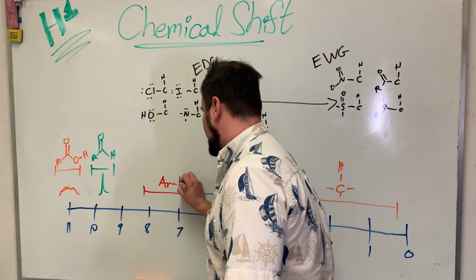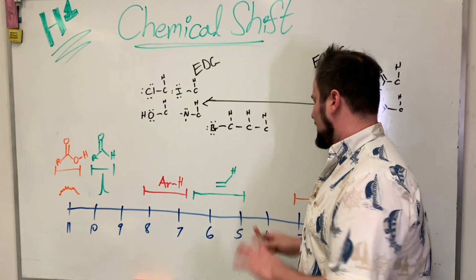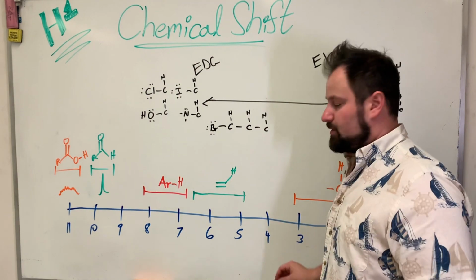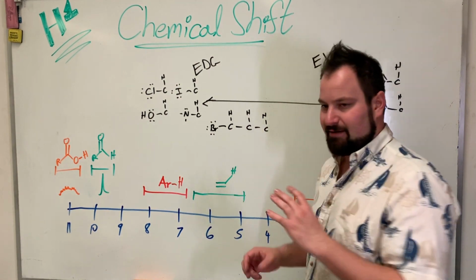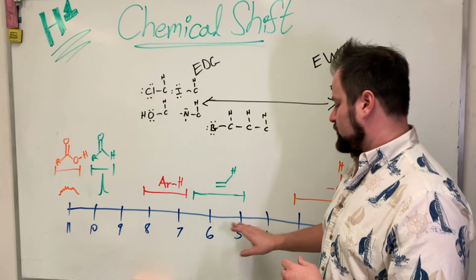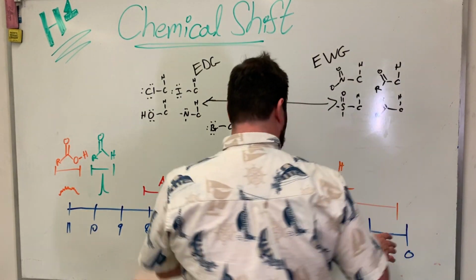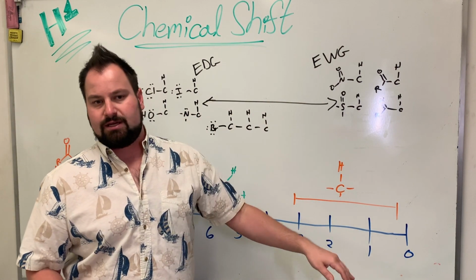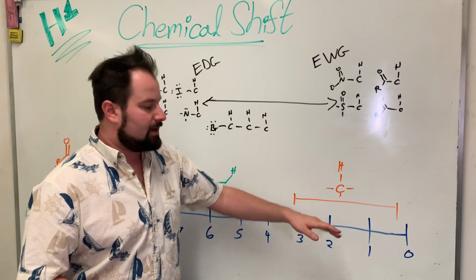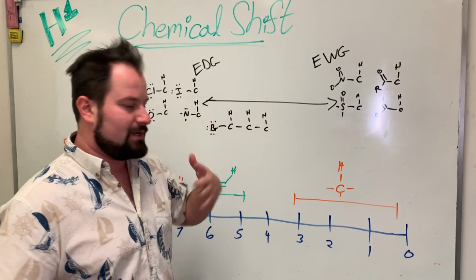It's not the C's. It's the H for each one that shows up, because it's proton NMR. So a double bond that happens to have an H on it will show up usually in the 5 to 6 range. And then finally, all the way down here, this is where all the standard CH single bonds are, within reason, usually between 0 and 3.